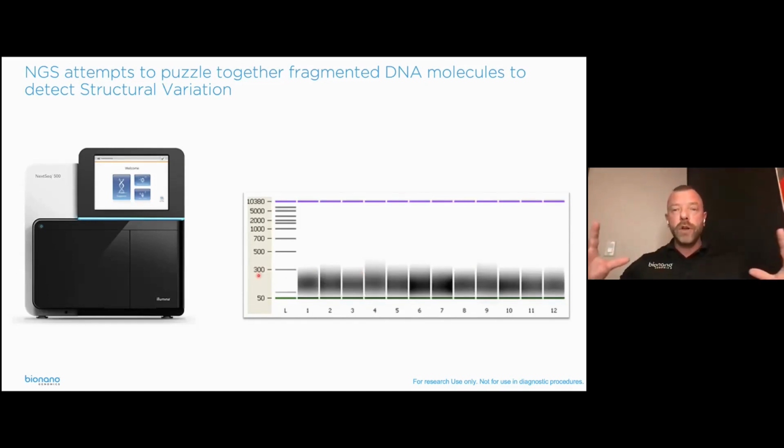The entire genome, with its perfect, intact, beautiful structure, gets fragmented into tiny little bits that you then put on your sequencer and analyze. And then after you've destroyed that structure of the DNA, you try to piece all these little fragments of a couple hundred base pairs together, trying to figure out what the structure was before you destroyed it in the first place. It just doesn't make any sense.